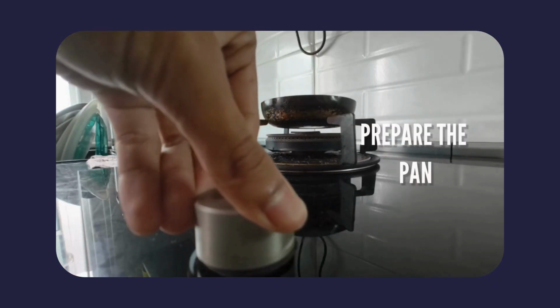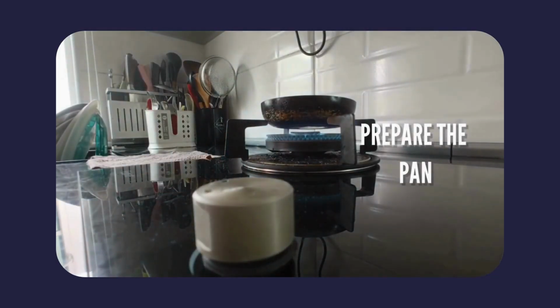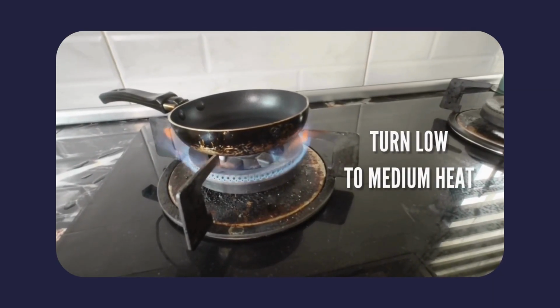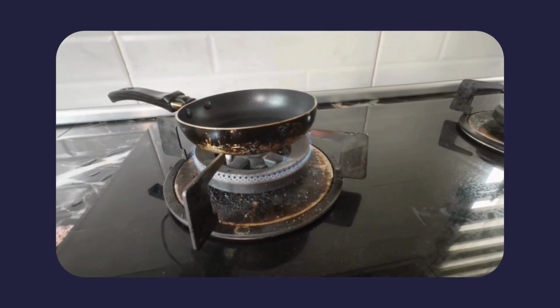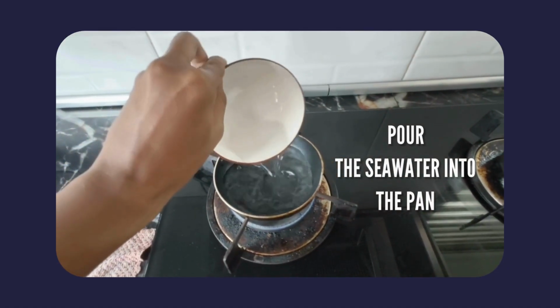Prepare the frying pan. Use low to medium heat. Don't leave it unattended. Now pour the seawater into the frying pan.